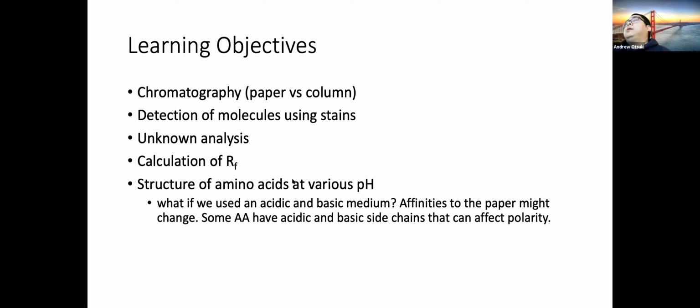Okay, so calculation of RF. In paper chromatography, there's something called RF, and it tells us how far our analyte traveled up the paper, or the stationary phase. We'll talk more about that later.